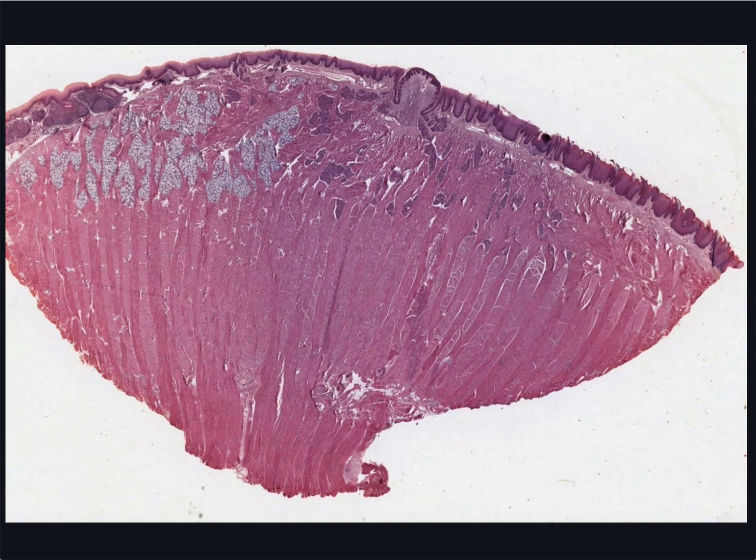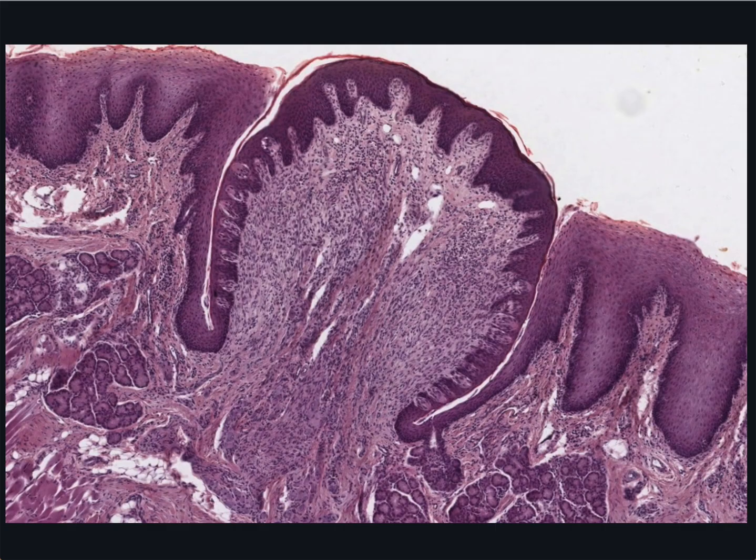It's now worth our while looking at this circumvallate papilla at a higher magnification. 9 to 12 circumvallate papillae are arranged in a V shape pointing posteriorly. They're shaped like fungiform papillae, but are much larger, about 2 to 3 millimetres. And they're surrounded by a trench with serous glands, or glands of von Ebner, underneath, and the taste buds are in the walls. The glands empty into the trench to keep the taste buds washed.